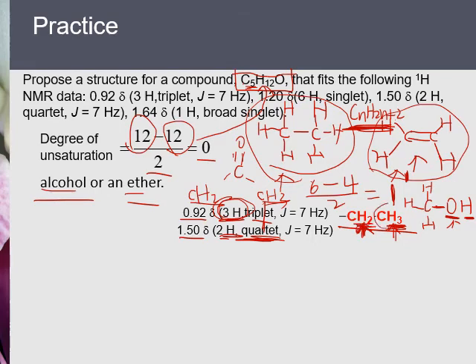Again, CH3 appears as a triplet, CH2 appears as a quartet. So that meets these requirements.